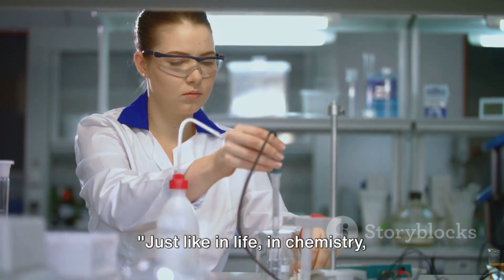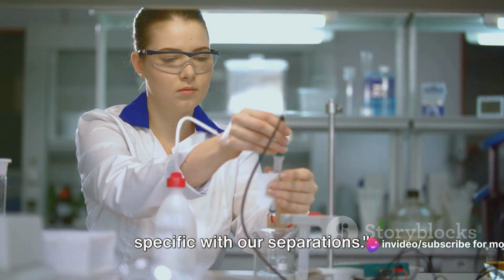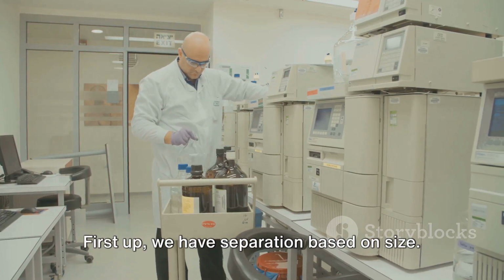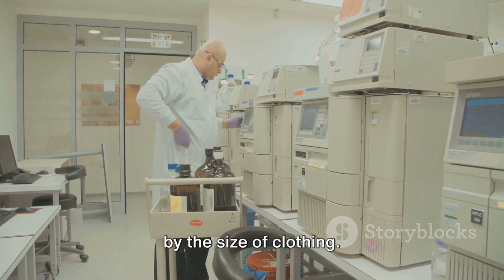Just like in life, in chemistry, sometimes we need to get a bit more specific with our separations. Now let's delve into the more advanced separation techniques. First up, we have separation based on size. This is a bit like sorting your laundry by the size of clothing.